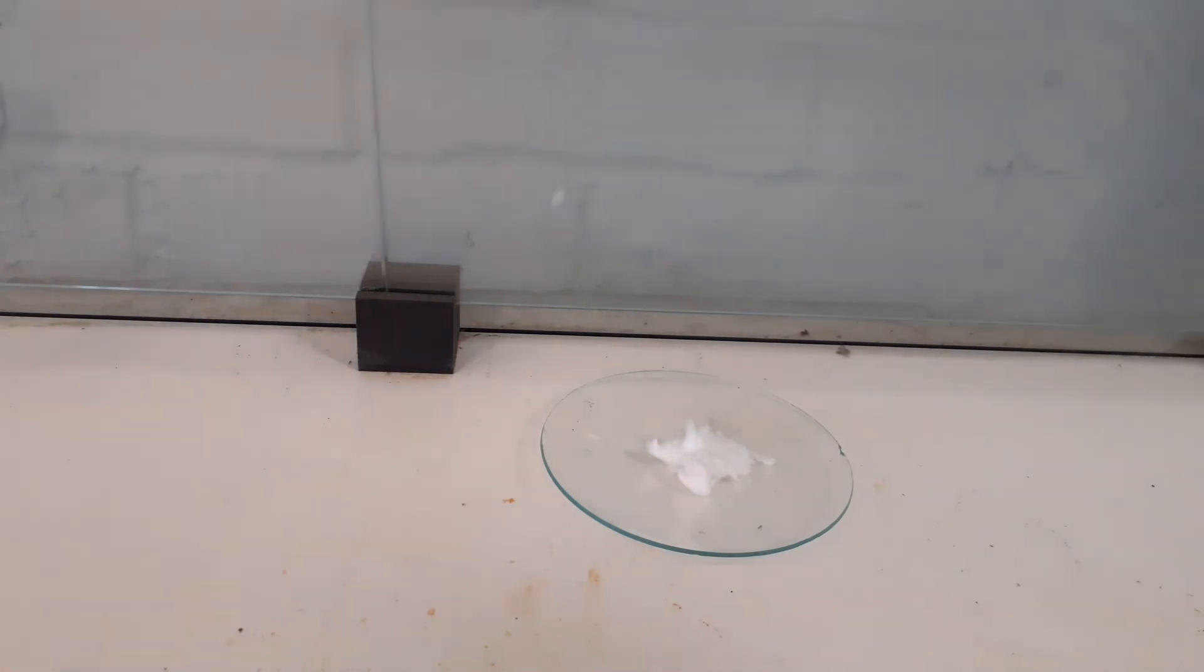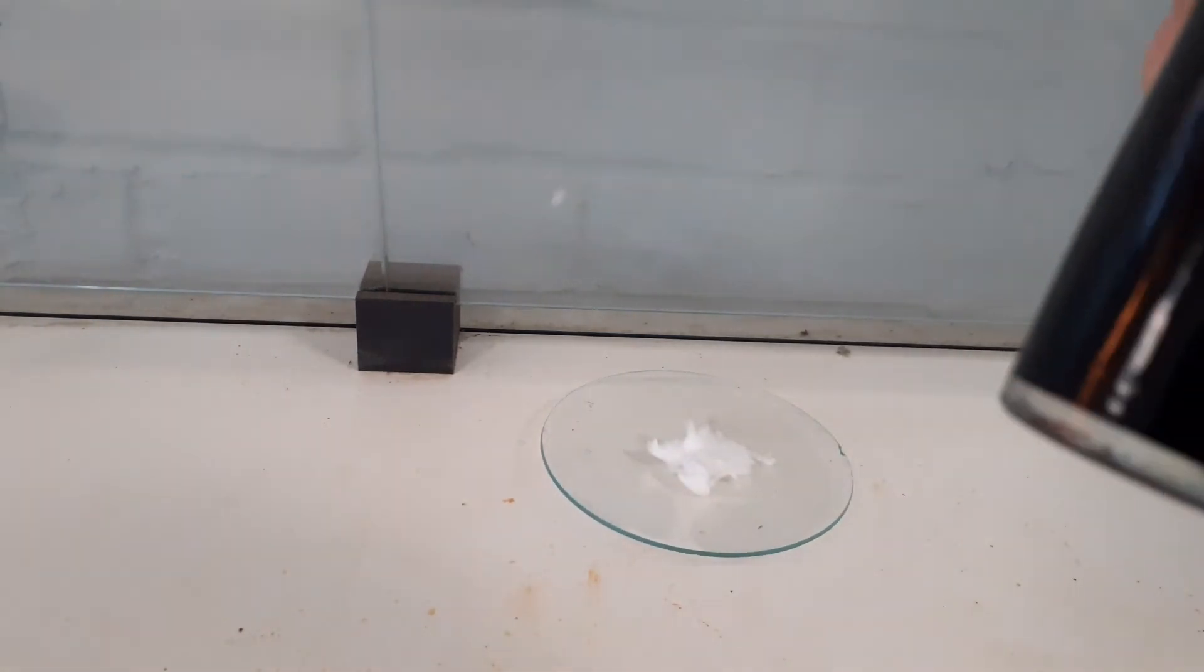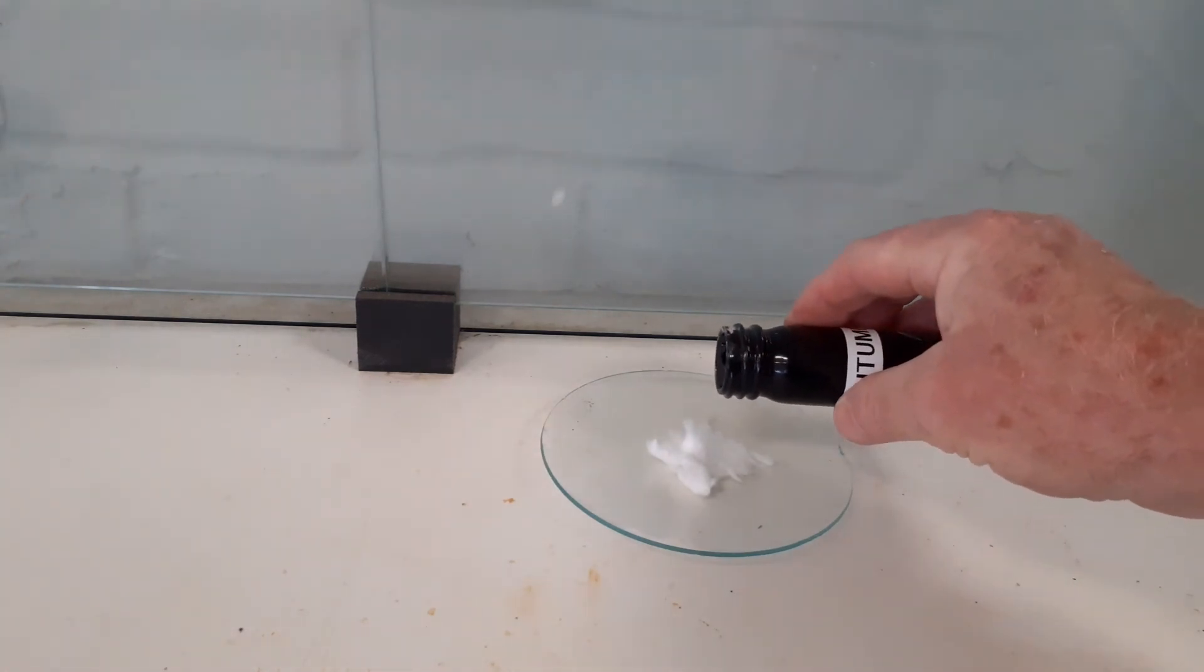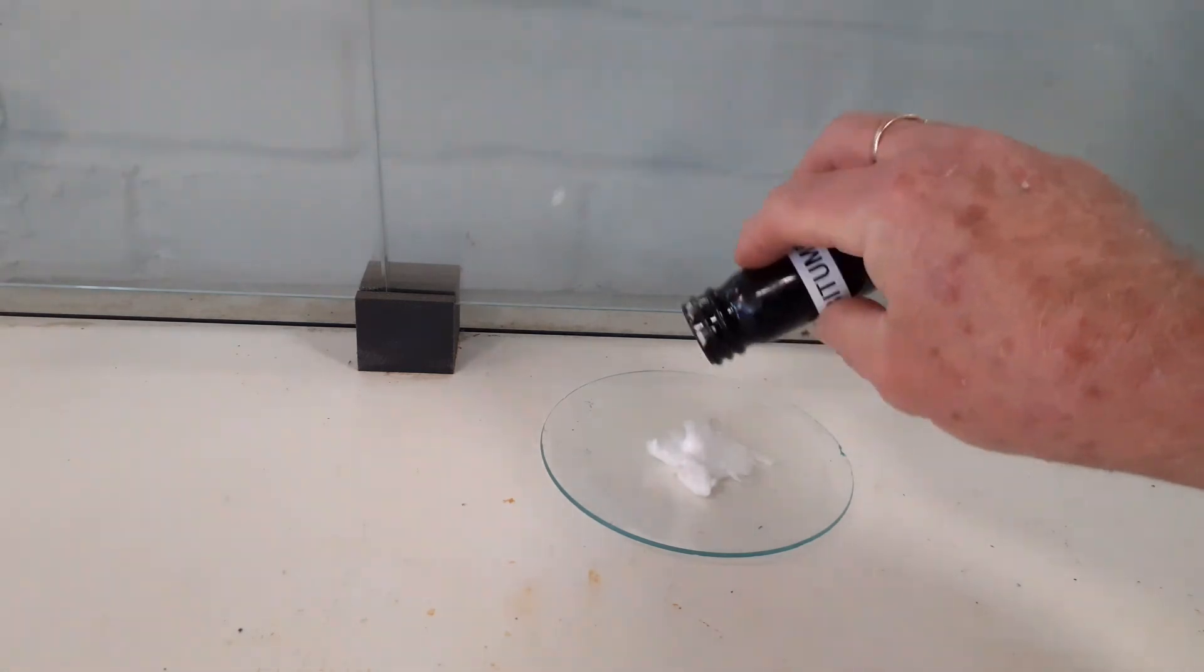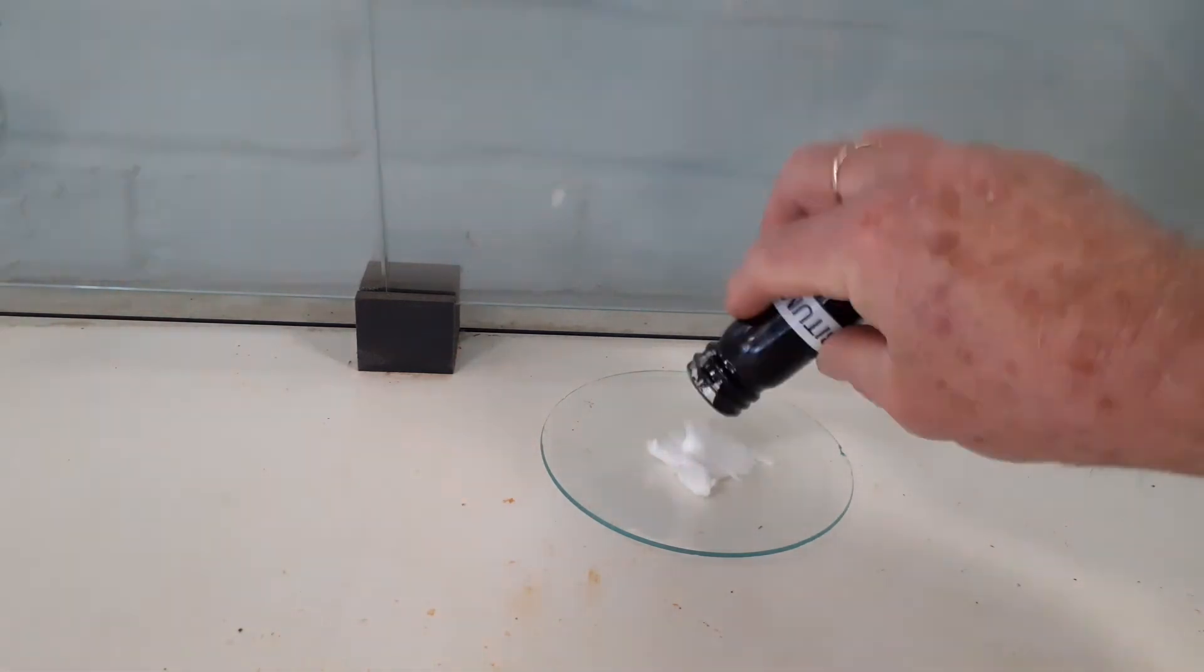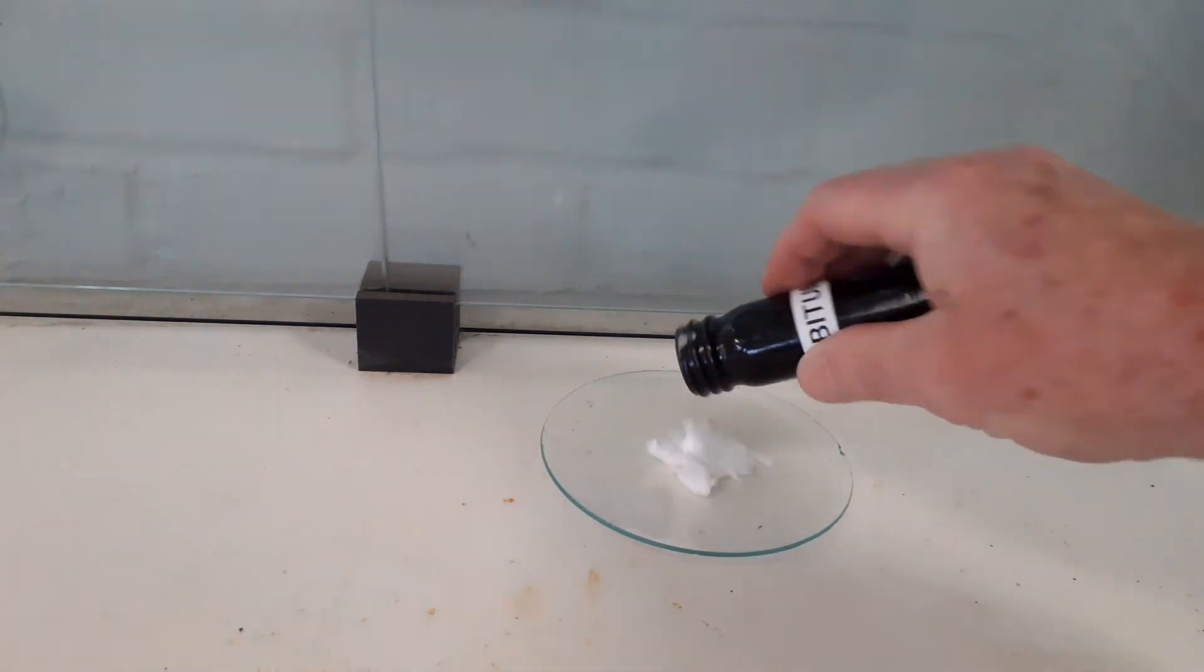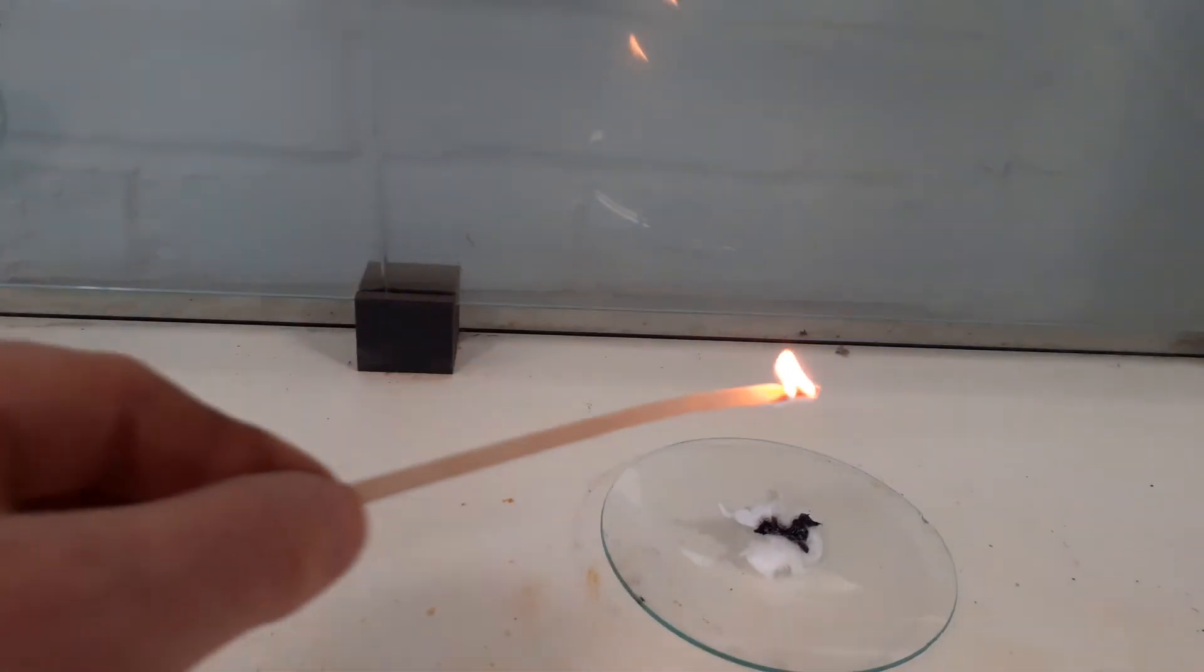But lastly we've got bitumen, this thick dark black liquid. I'm going to pour it so you can see how thick it is. It's so thick that we may be here forever trying to get it out. In the end I had to cheat and spoon it out otherwise we'd be here forever. Now let's try and lighting it.